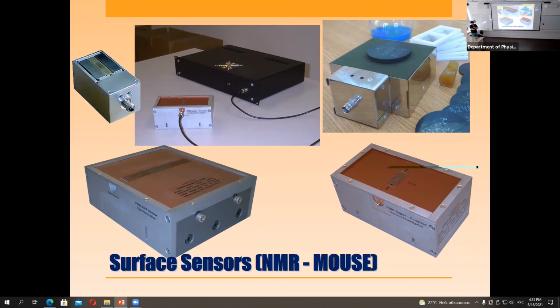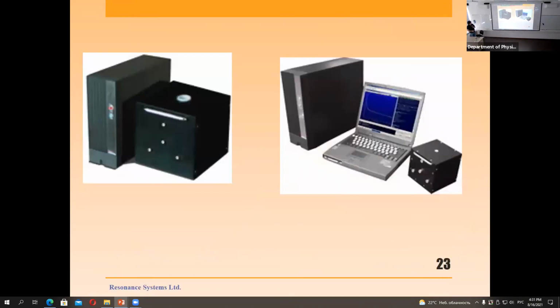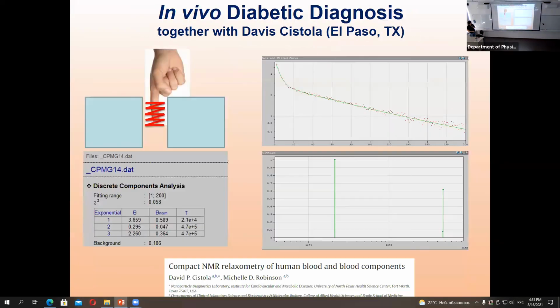From 15 to 25 megahertz. Simple, guys: a coil, two capacitors, and the magnet. Then this is something that we built later. Not really nice. So we have built, I think, hundreds of different solutions. We like to work both with universities with interesting projects, and also for industry, because we need to earn money.